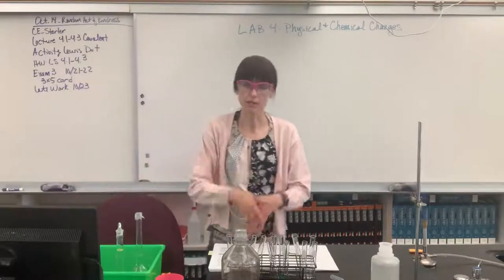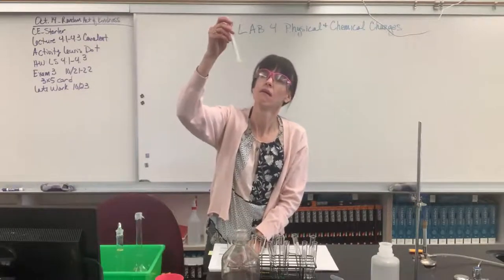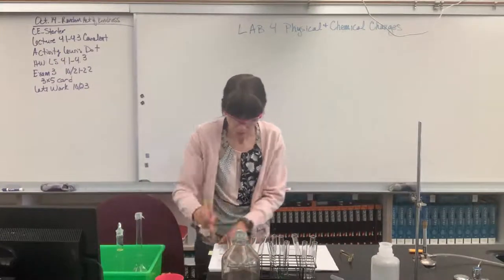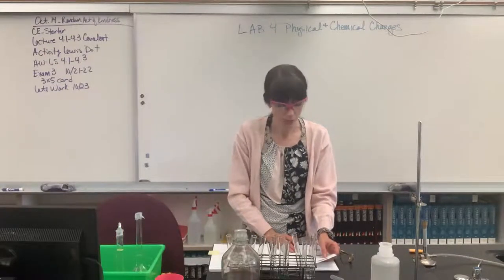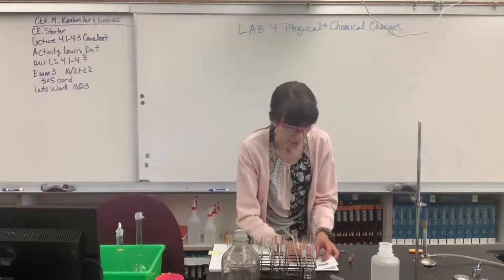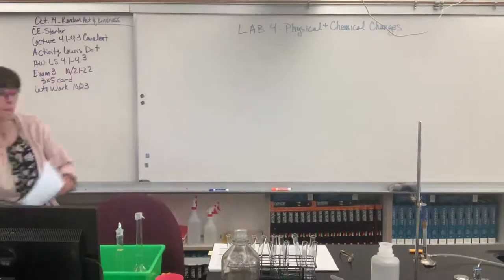Okay, so back to iron 3 chloride. We added silver nitrate and it's an opaque, creamy yellow color. Let's go ahead and record that. So if you turn to page 54, it says result of adding the silver nitrate to the test tube solution. Let's put opaque yellow. Opaque yellow.